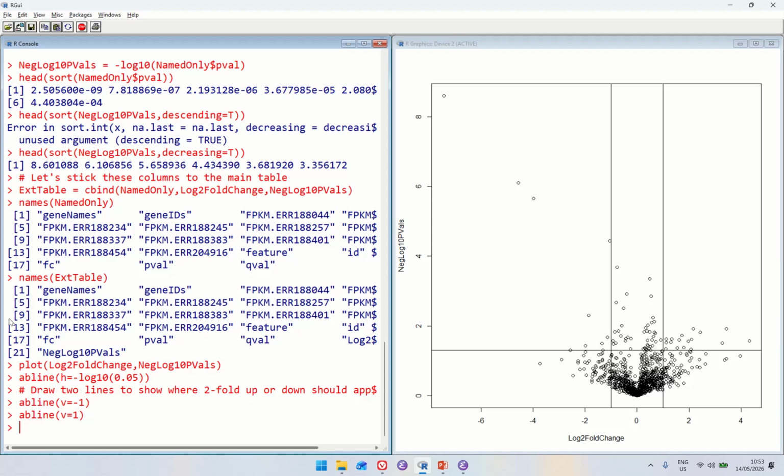We also have 2 vertical lines though. This one represents higher in, oh gosh, I should know this one, higher in females. So anything to the left of this line is higher in, say, females, and then anything to the right of the other line would be higher in males instead. So a statistician would probably say, why are you even bothering with having the left and right lines on here?